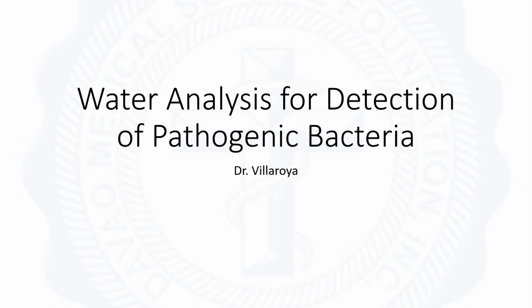I will be discussing water analysis for the detection of pathogenic bacteria. Water is very essential to life, so as much as possible, it should not only be safe but also be pleasant to drink. It should be clear, colorless, and devoid of disagreeable taste or smell. And most importantly, class, it should be free from microorganisms.